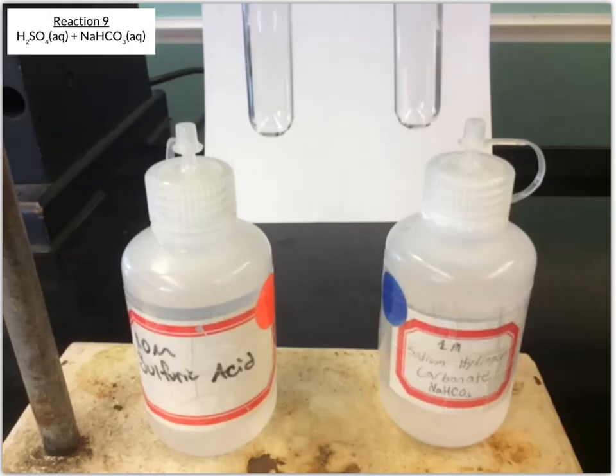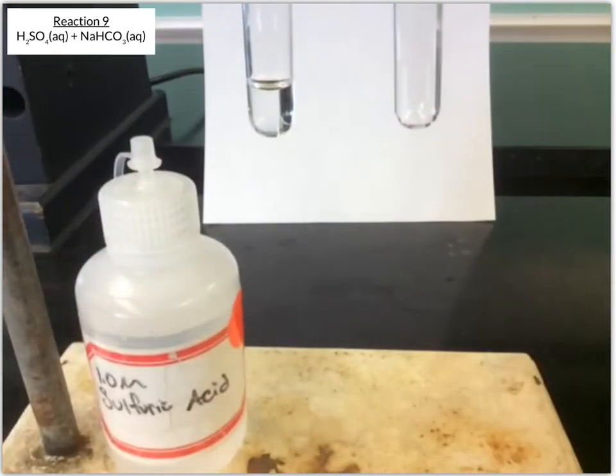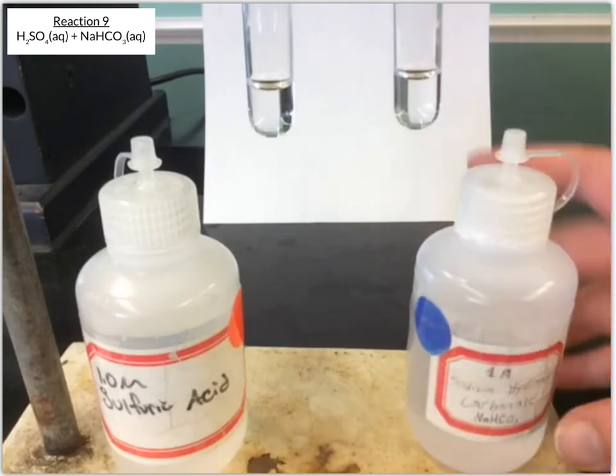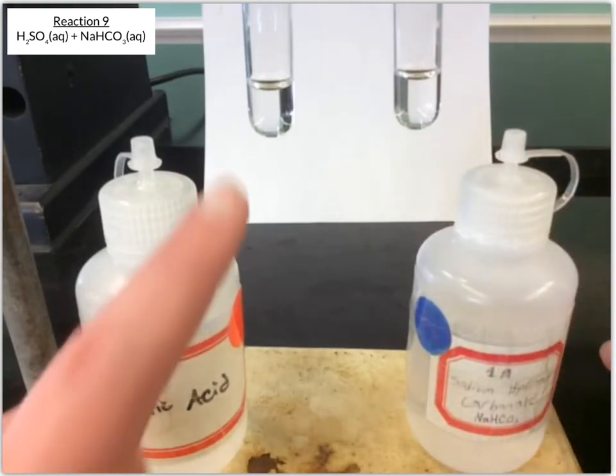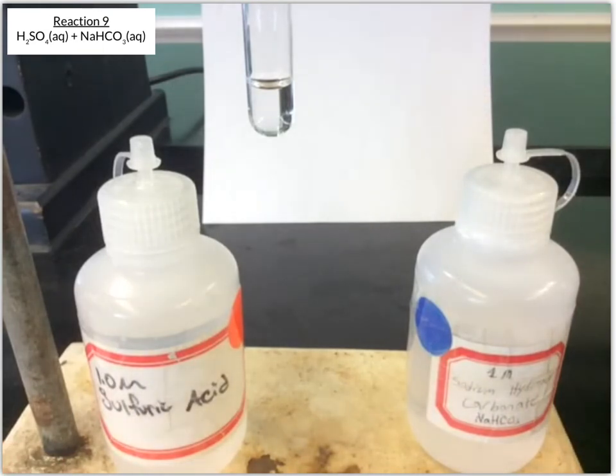Okay, so the final reaction, reaction number 9, we're going to react sulfuric acid with sodium hydrogen carbonate. Okay, so both of our starting solutions are clear colorless solutions. We're going to take the sodium hydrogen carbonate solution, and we're going to pour that into the sulfuric acid.